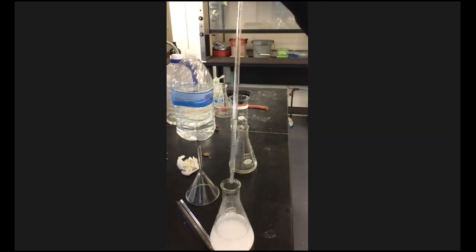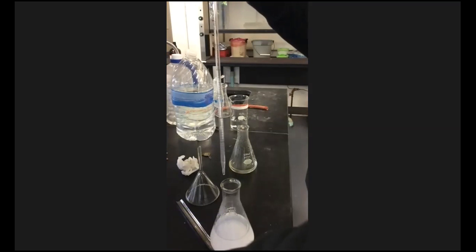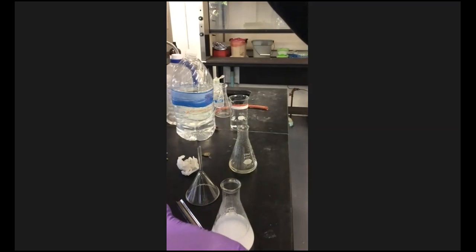Yeah, but it's got to be dry though. So we're going to do that. I'm going to send y'all that information later. So once we filter it, that's going to be the end of this lab. So that's that. I'm going to do one more. Do this in here.